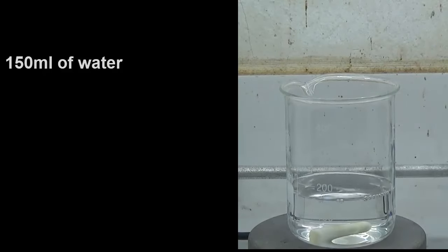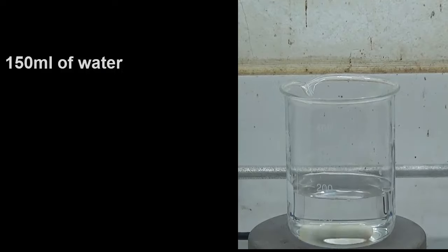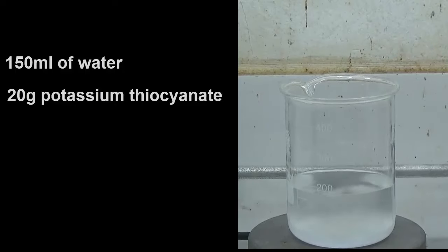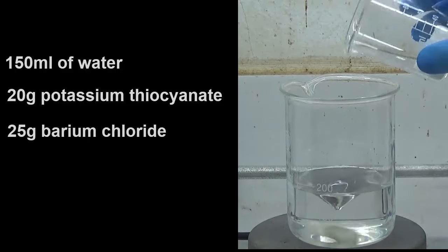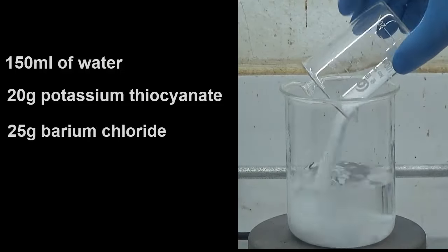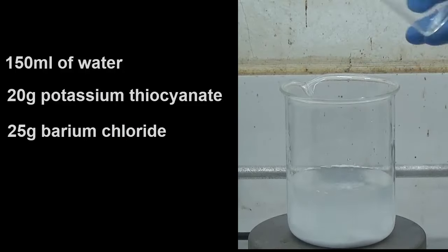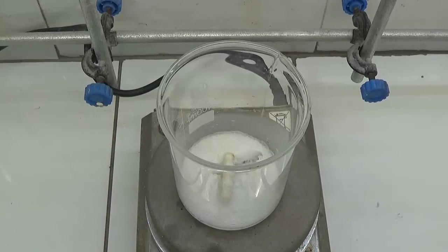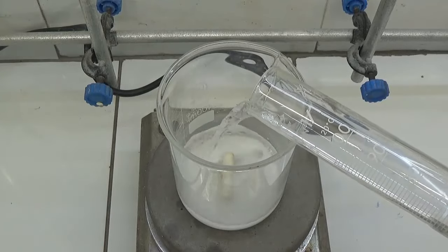To get barium thiocyanate, dissolve in 150 milliliters of water 20 grams of potassium thiocyanate and 25 grams of barium chloride. Boil the solution and evaporate all the water in a 60 degree Celsius oven. After the result has dried, dilute with 100 milliliters of ethanol.